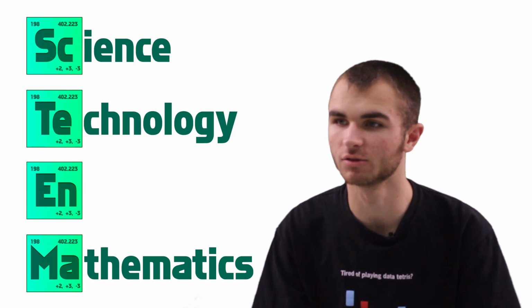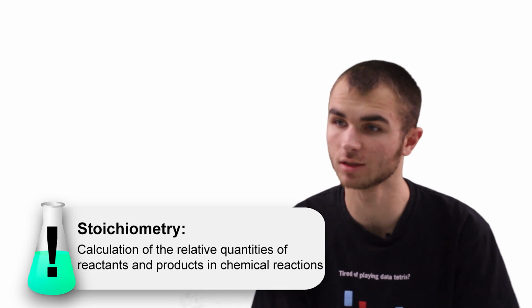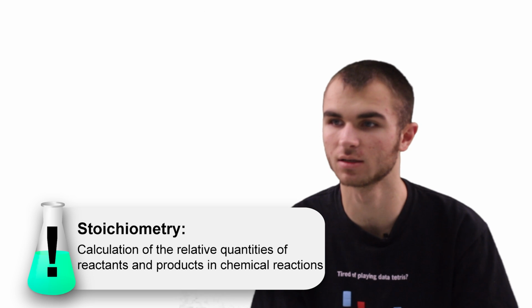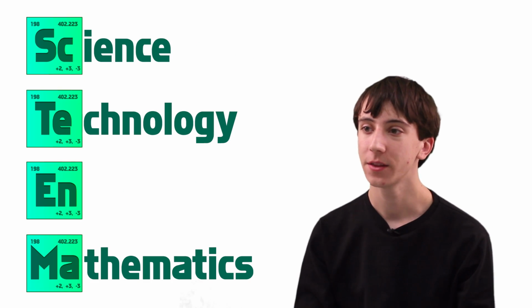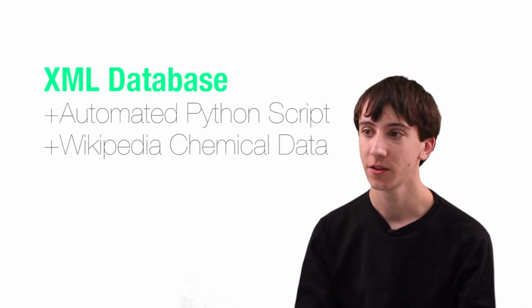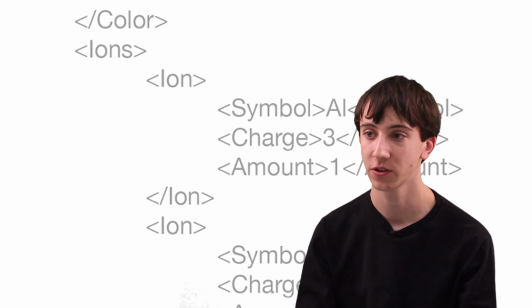We utilized our knowledge of stoichiometry to create the framework for simulating reactions, and math to design the quantitative calculator portion of the app, which outputs relevant numerical data pertaining to the reaction being performed. The app draws from a database which contains the equations for basic reactions, as well as the visual result of that reaction. This method makes the app very scalable. It's easy to update the app's functionality in the future to support more complicated reactions, as well as additional chemicals.